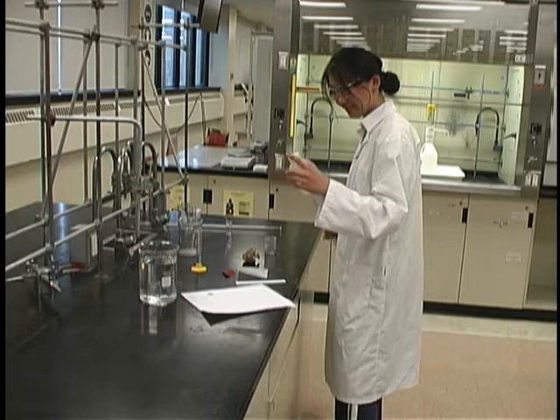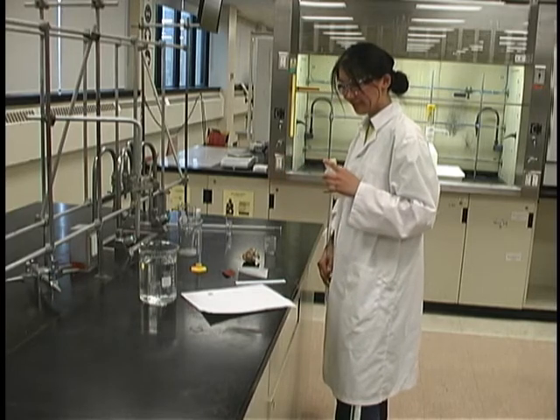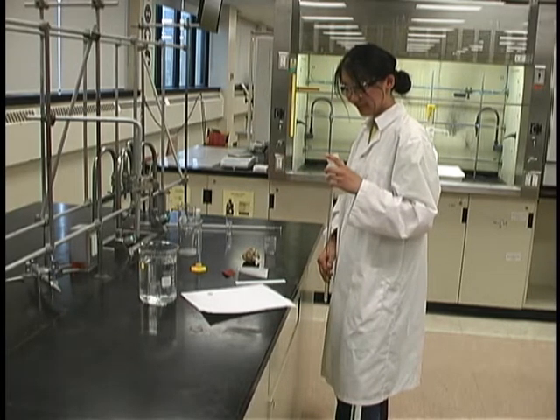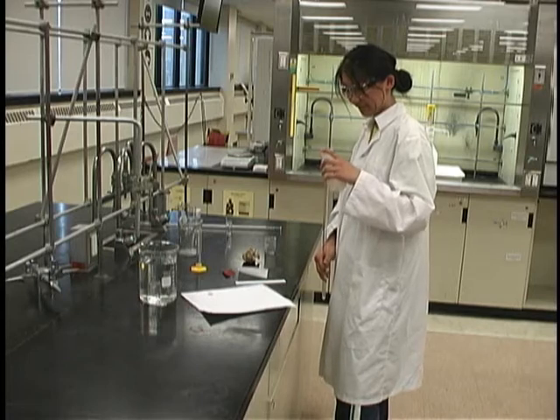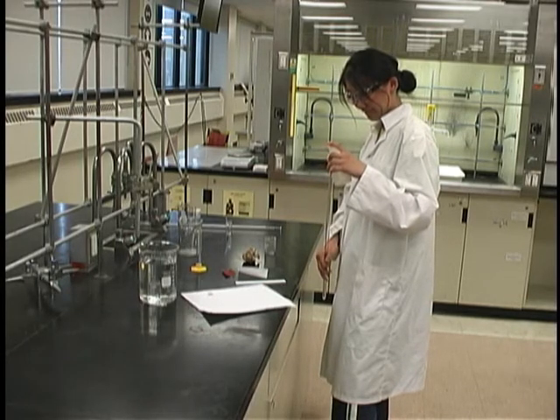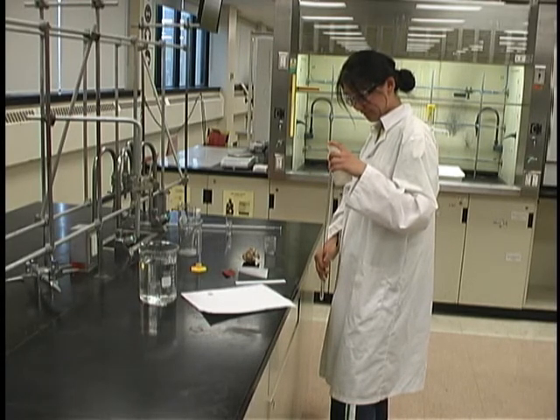Please remember that this experiment, unlike all the others, must be completed in 90 minutes. This is a brief overview of what you will be doing in lab 2.